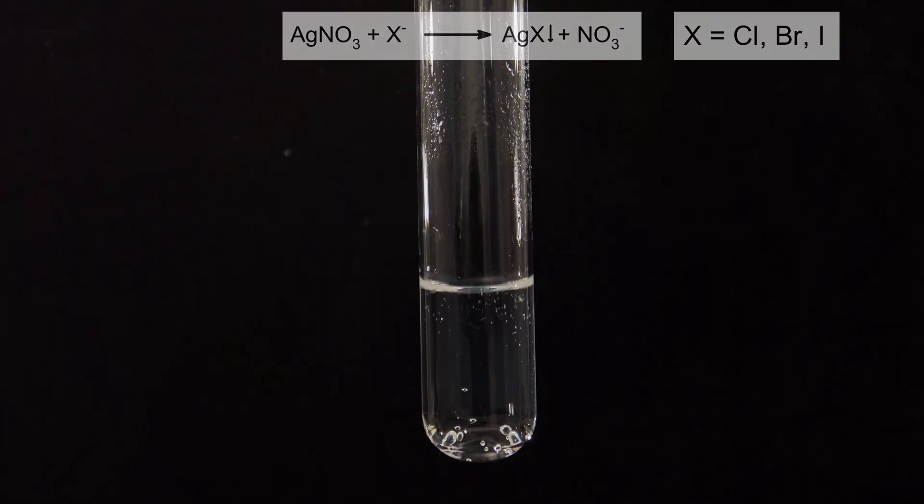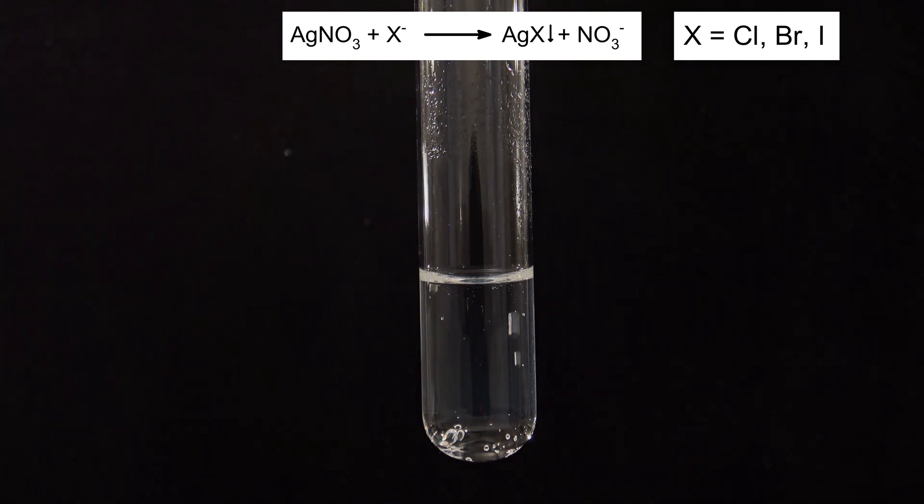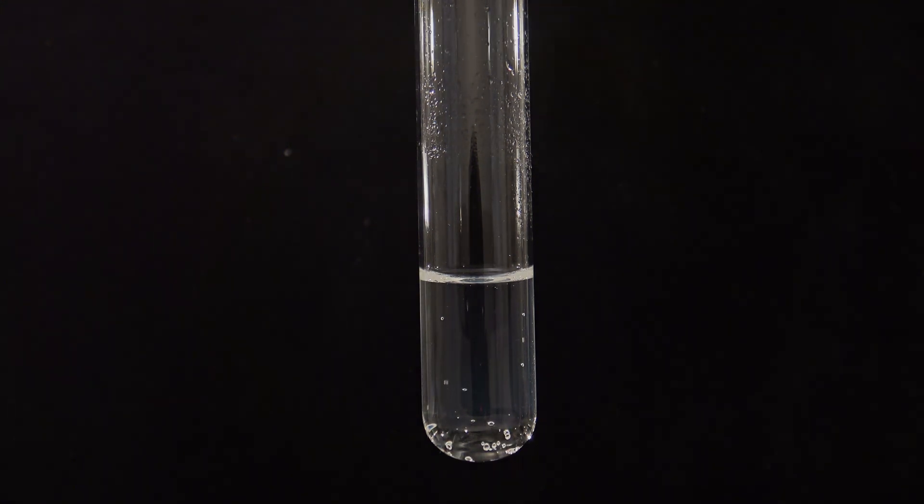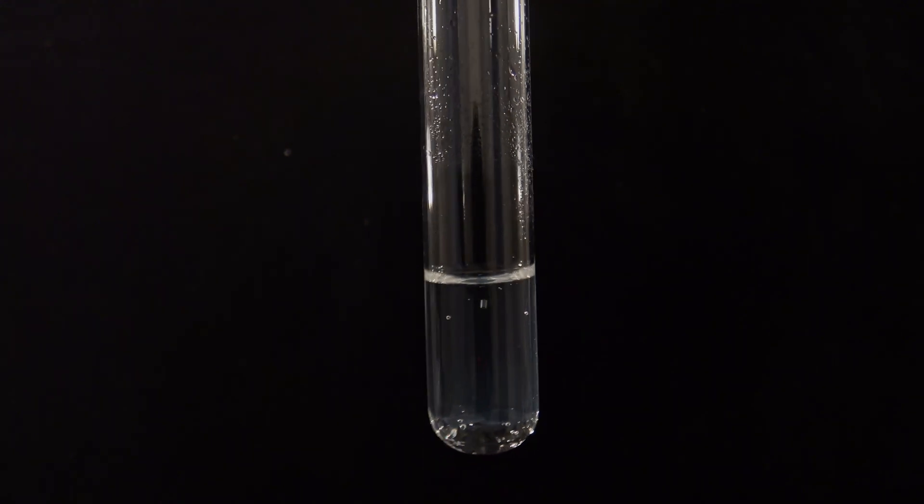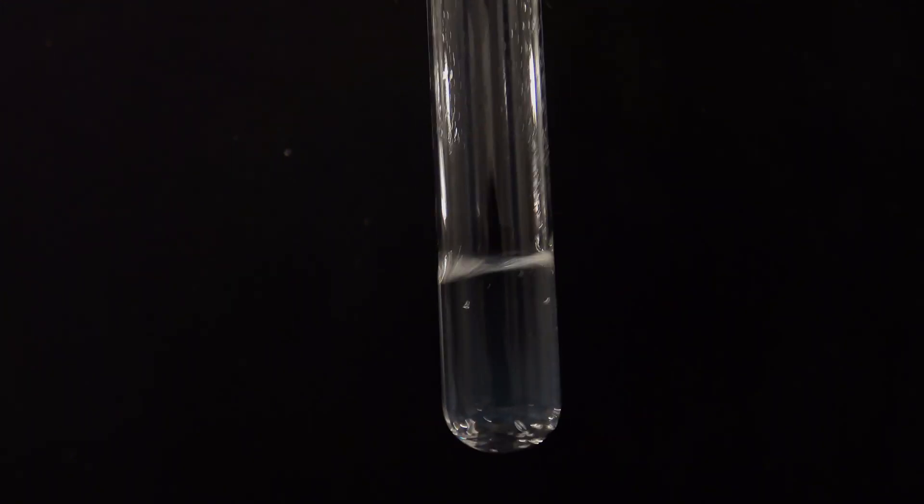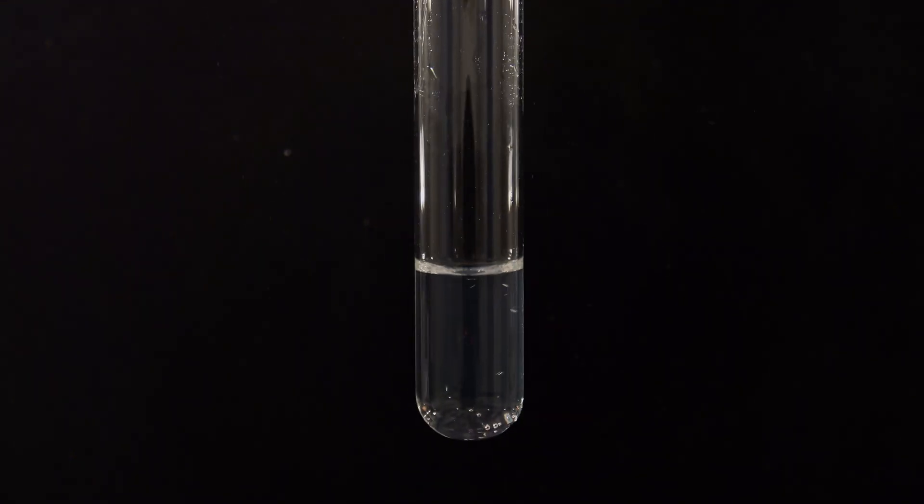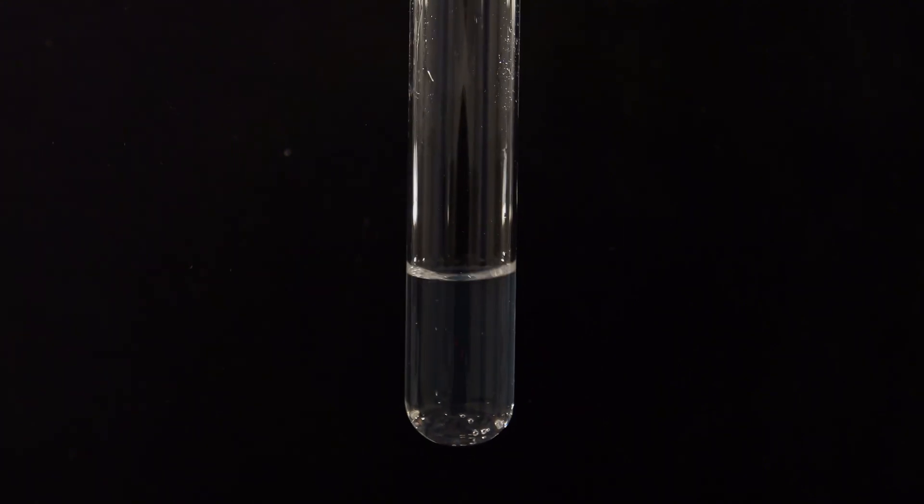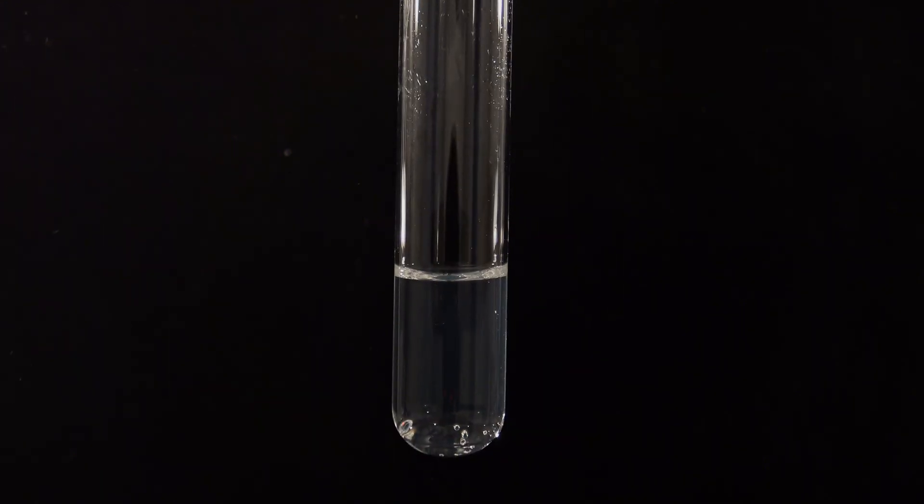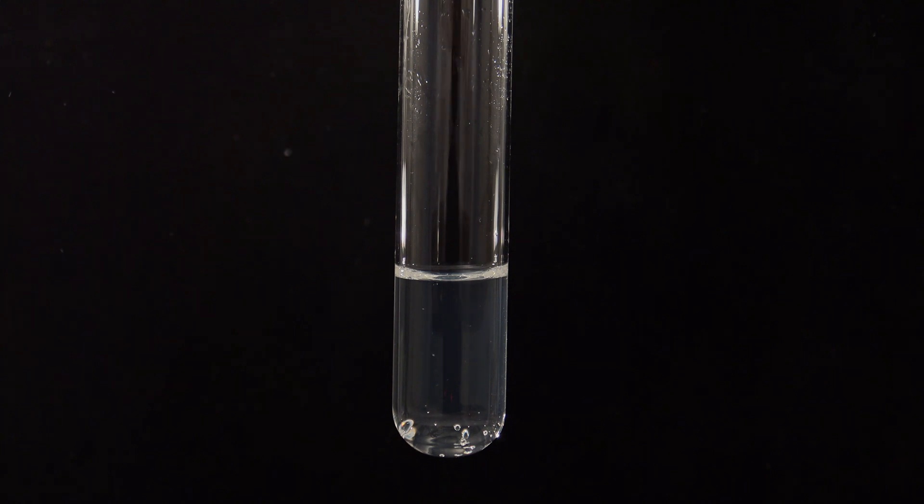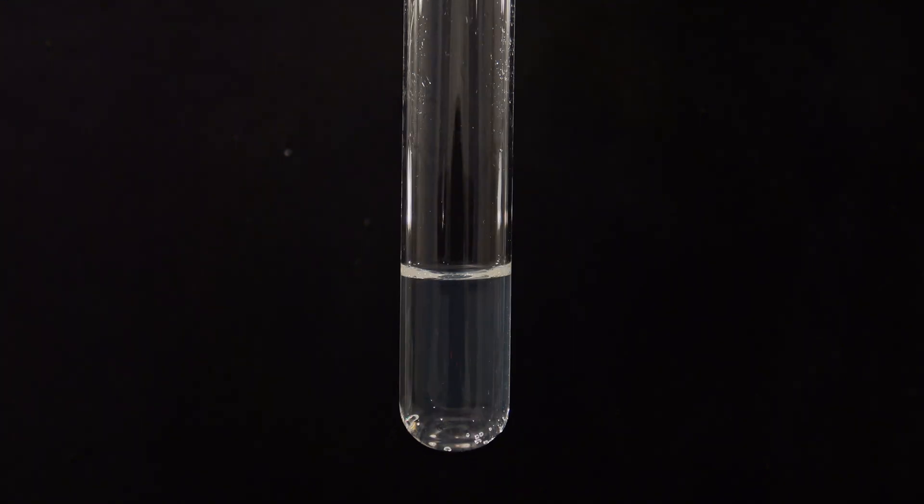Silver nitrate reacts with halide ions to form insoluble silver salts. Only a slight cloudiness became visible, but this is already a proof for the presence of halide ions. This can happen when too much nitric acid was added. That's why usually one or two drops of diluted ammonia are added to increase the amount of precipitate. The same effect could be observed when diluted ammonia was added in the next step.